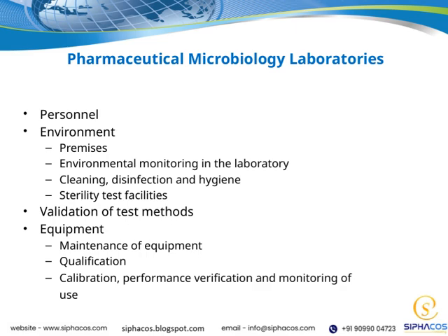Next, I want to emphasize the importance of environmental monitoring in the laboratory. Regular monitoring helps us detect any potential contaminants early and maintain a safe, sterile environment. This is critical for maintaining the integrity of our tests and ensuring product safety.